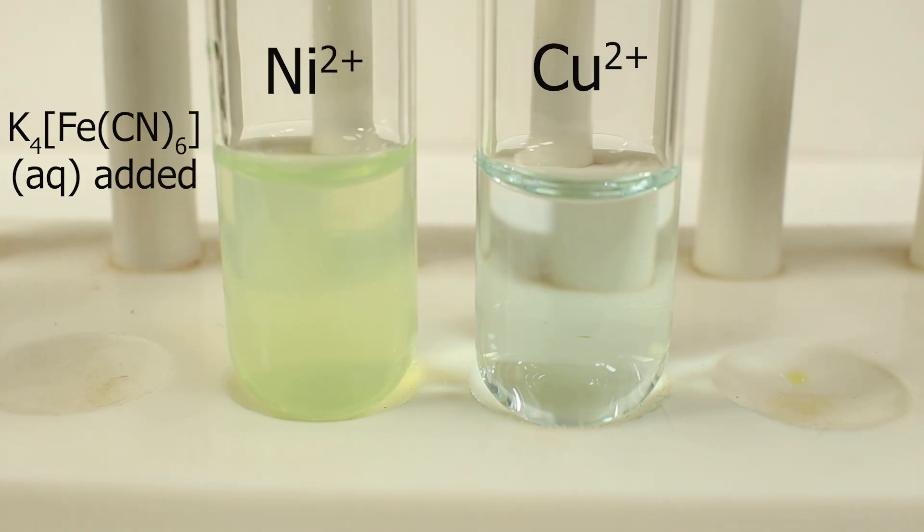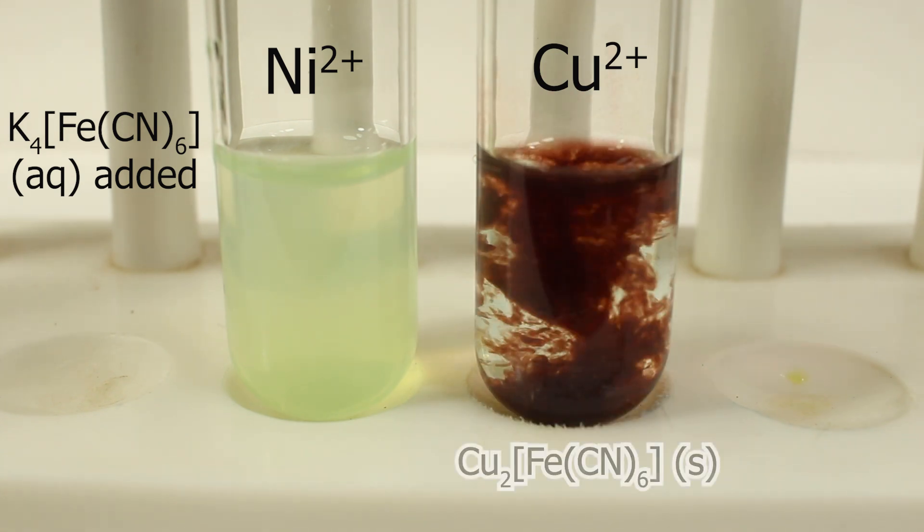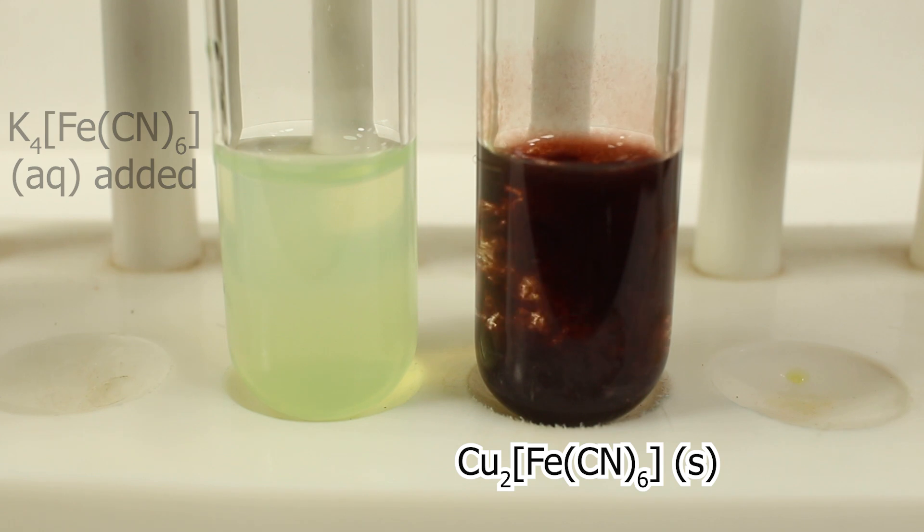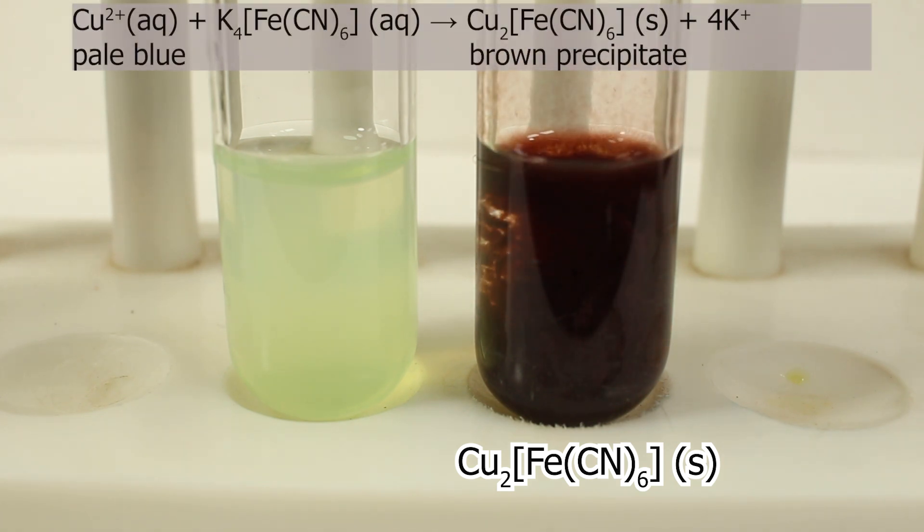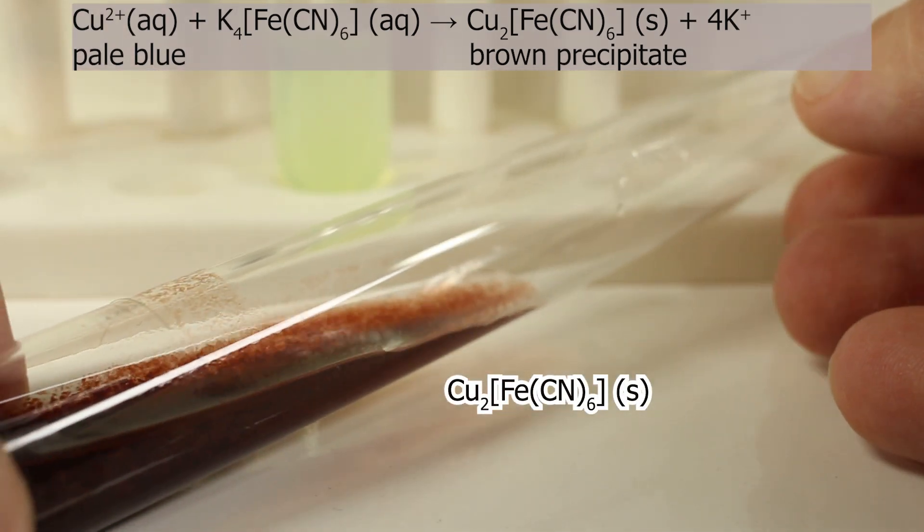In case of copper II let's see what happens. Formation of chocolate brown precipitate. Positive result for copper ions on addition of potassium ferrocyanide. It's copper II ferrocyanide precipitate, chocolate brown.